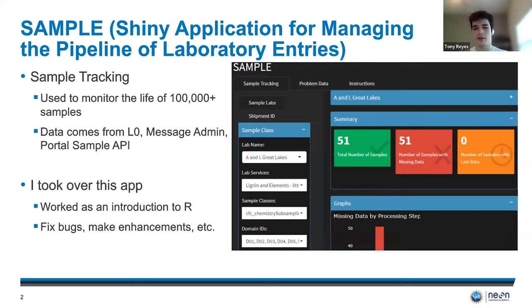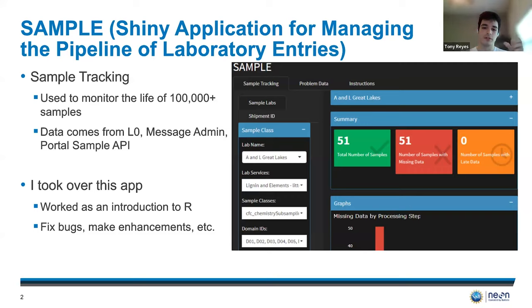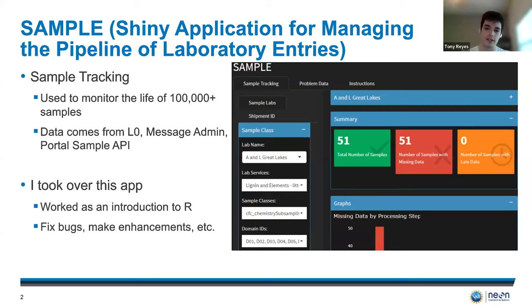One of the things that the user can do is select a lab name, a lab service, domain, date range, etc., and they will get some general information about the samples. You can see how many samples are in that specific location, how many of them are missing, and how many of them are late.